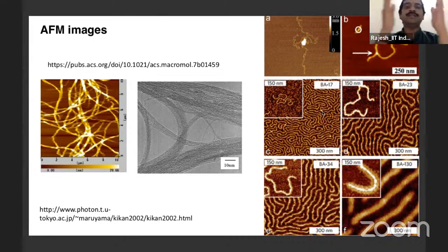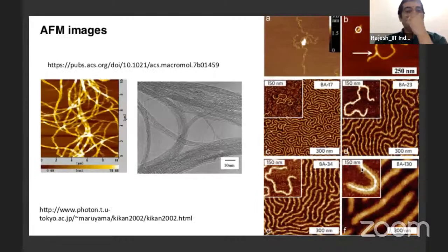And polymer में क्या होता है कि बहुत सारा इतना लंबा चेन है, तो पूरा यहाँ पर दिखाई देता है. ये एक पॉलीमर का एक चेन है. मान लीजिए आप ये पॉलीस्टाइरीन है, ये इस पेपर से यहाँ से लिया हुआ इमेज है. तो एक पॉलीस्टाइरीन की जो एक पॉलीमर है, ये वहां पे दिख रहा है, देखो कितना बड़ा है. ओके, नाउ अभी तक what could we see?